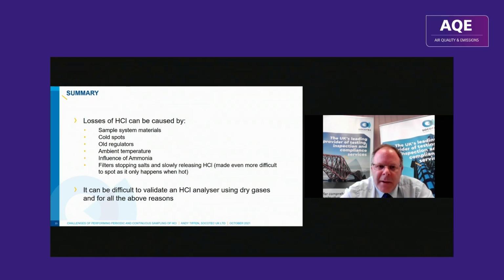So having a good think about stack temperatures, sample temperatures, and matching systems to get the same result, it can be really key on these sites.